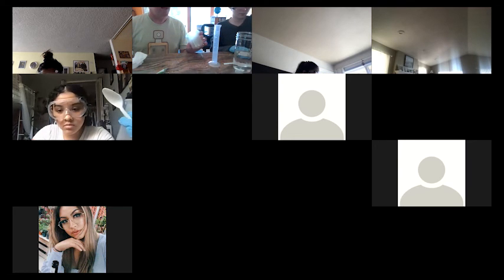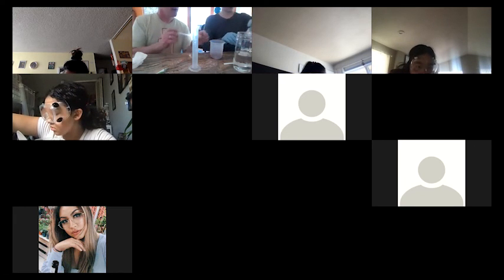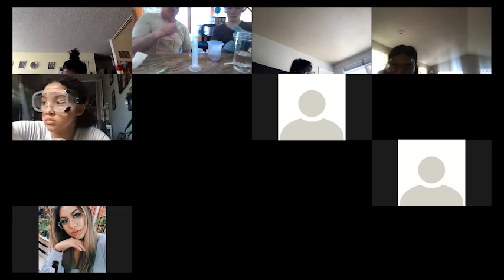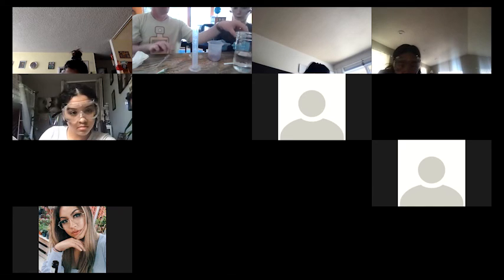All right. Oh man, this looks really good, Raj. All right. So now we can start our filtering. So the tricky part is trying to get this into there. So where are we filtering it? Right there.